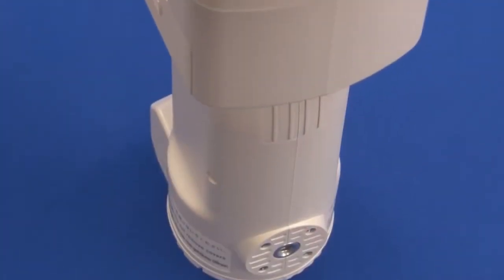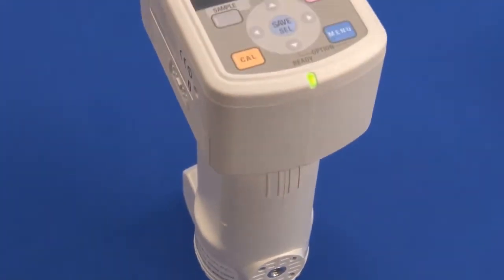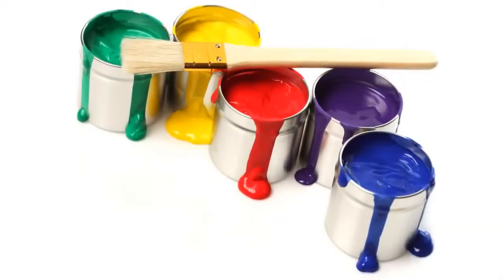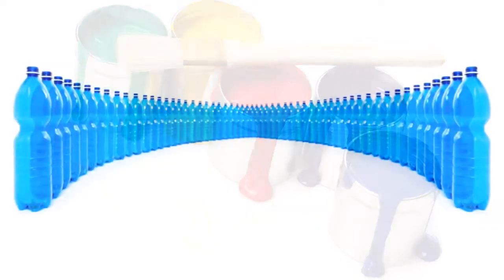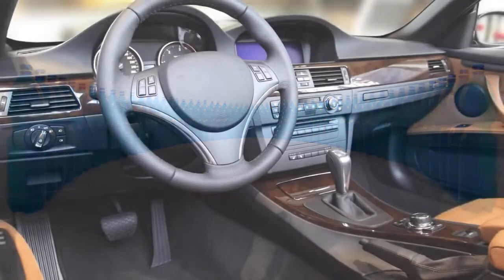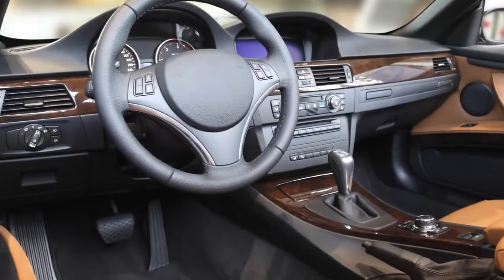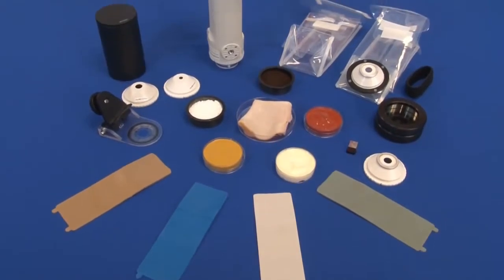The CM600D and 700D spectrophotometers are easy to use color instruments ideal for measuring paint, plastic, and automotive products. They provide highly accurate measurements to ensure color standards are being met throughout the manufacturing process.